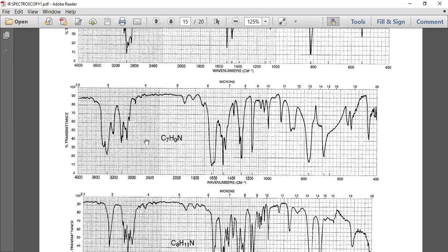Among the two, you see this nitrogen-hydrogen bond vibration is giving a doublet. Doublet means nitrogen possesses two hydrogens. So altogether, we can say benzene ring, then carbon attached to the benzene ring, then it is having an amine. Okay, so this is how we need to identify the given organic compounds.